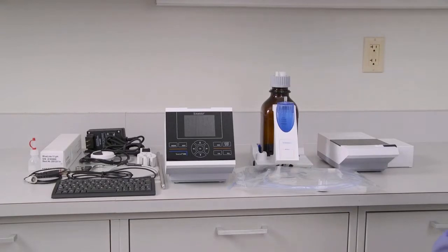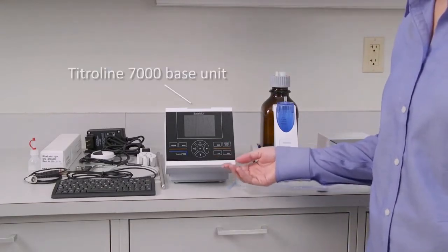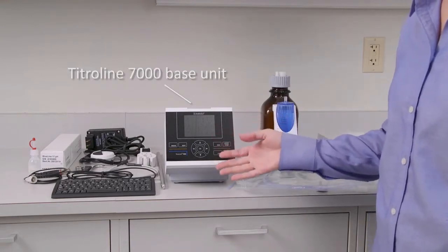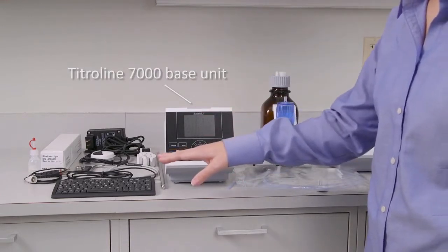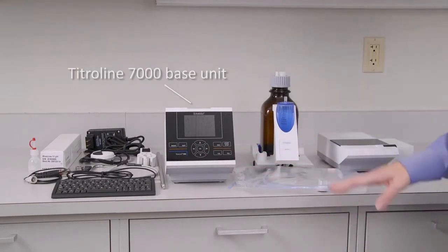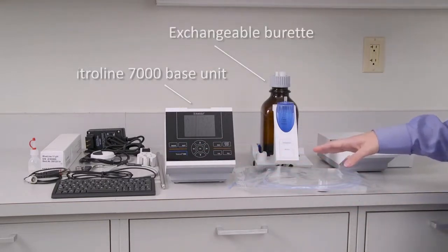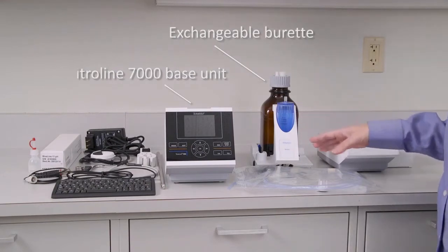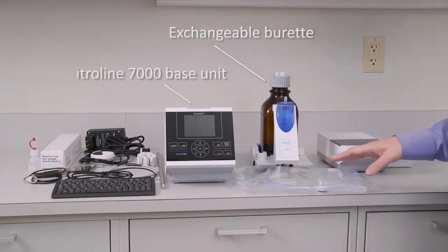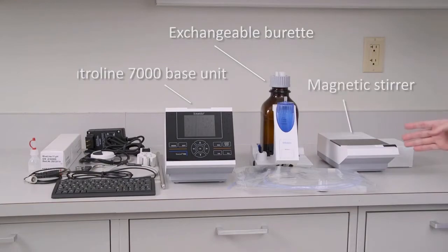We've got three main components of the system. The first one being the Titreline 7000 base unit - this is essentially the brain of the system, and all of the accessories that you see here will come along with that. The next part is the exchangeable burette, this is the slide on, slide off modular burette option that we offer, and all the tubing comes along with that. The final portion is the magnetic stirrer.